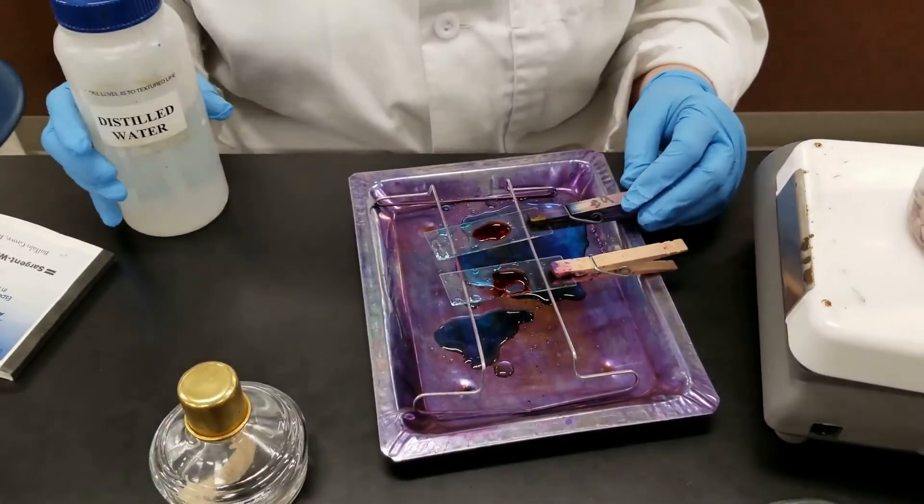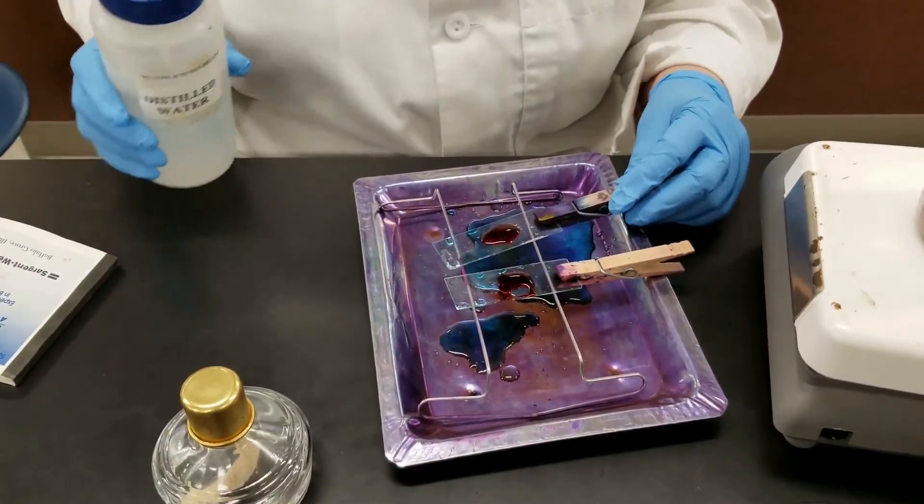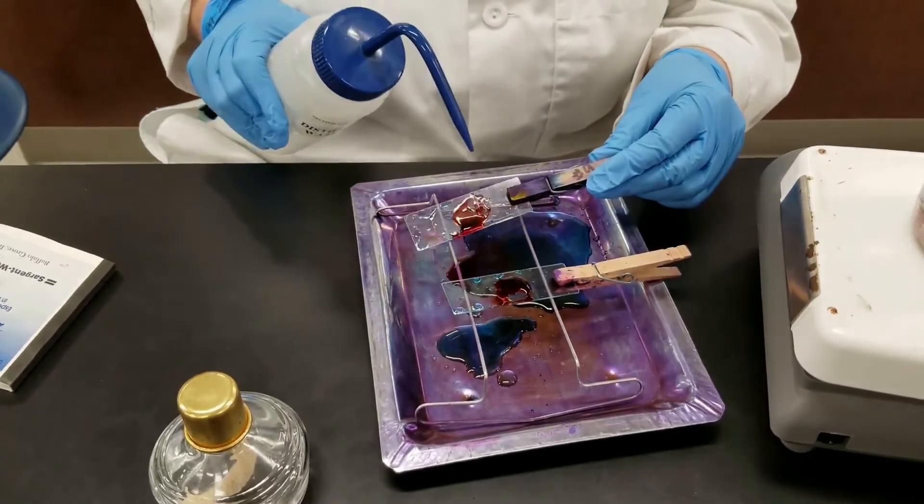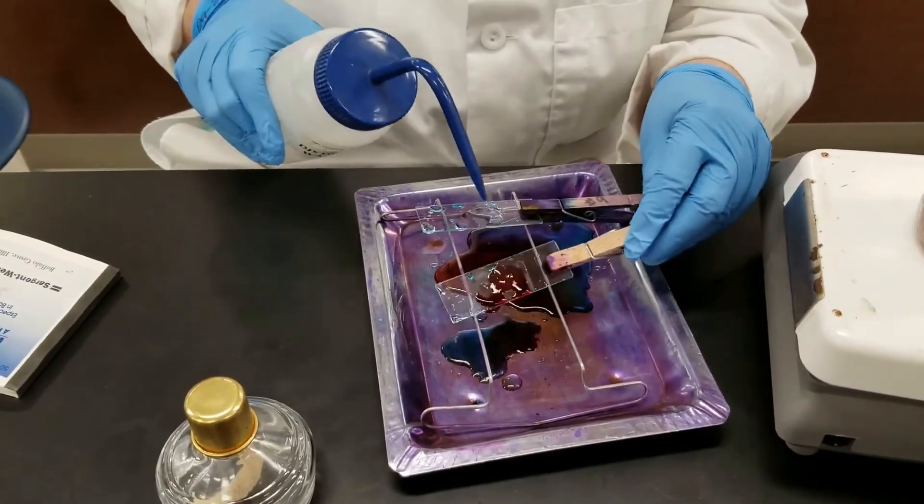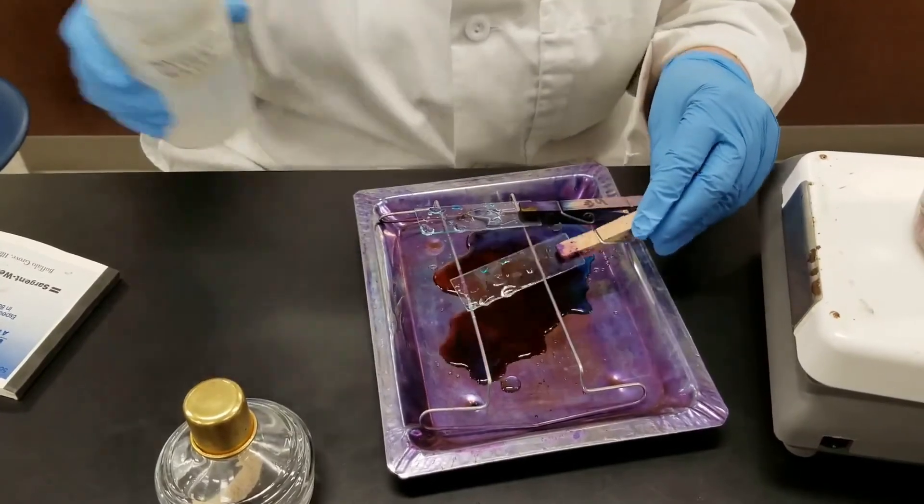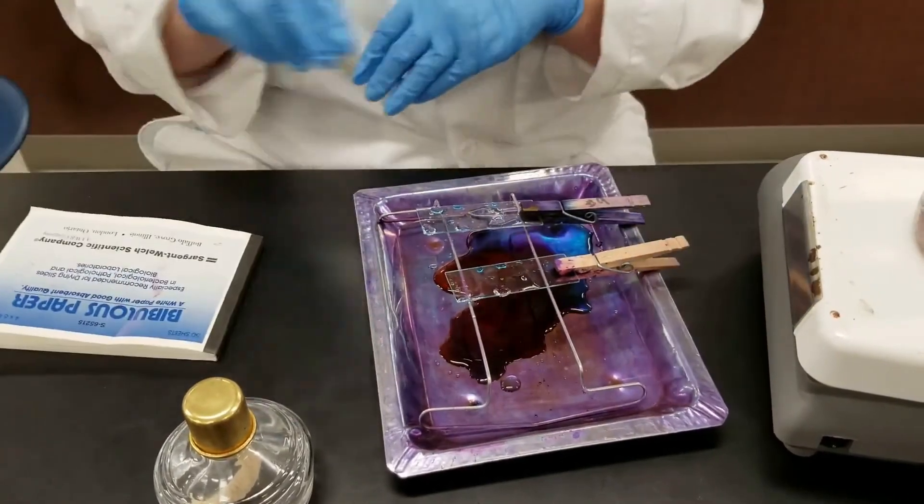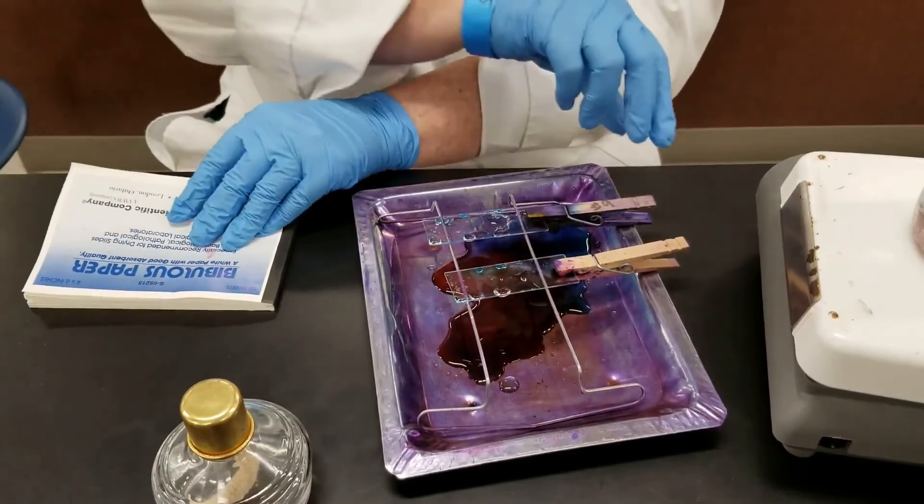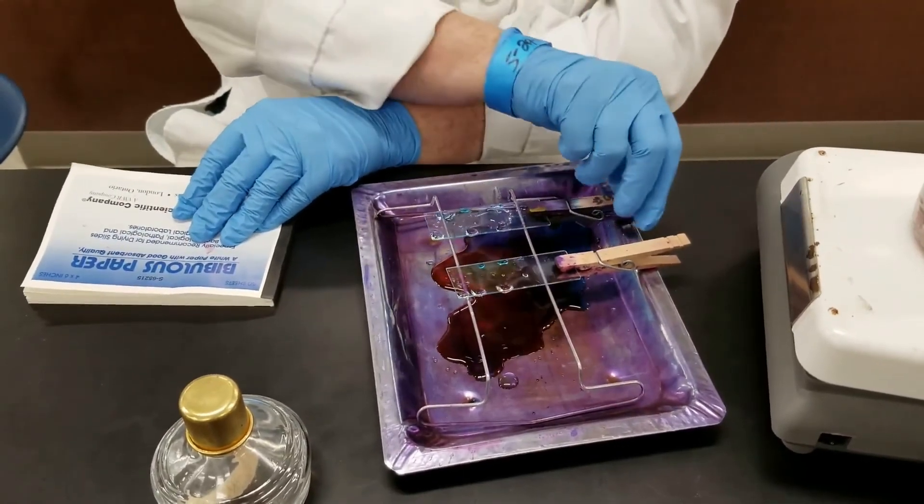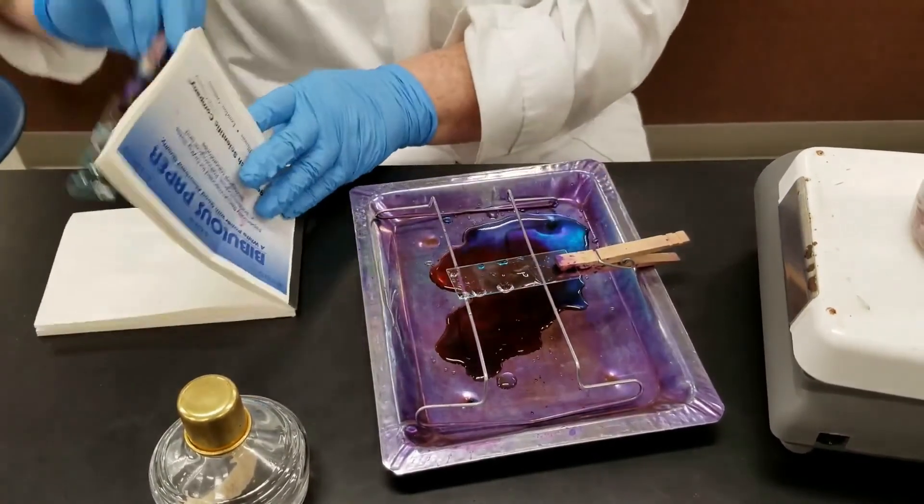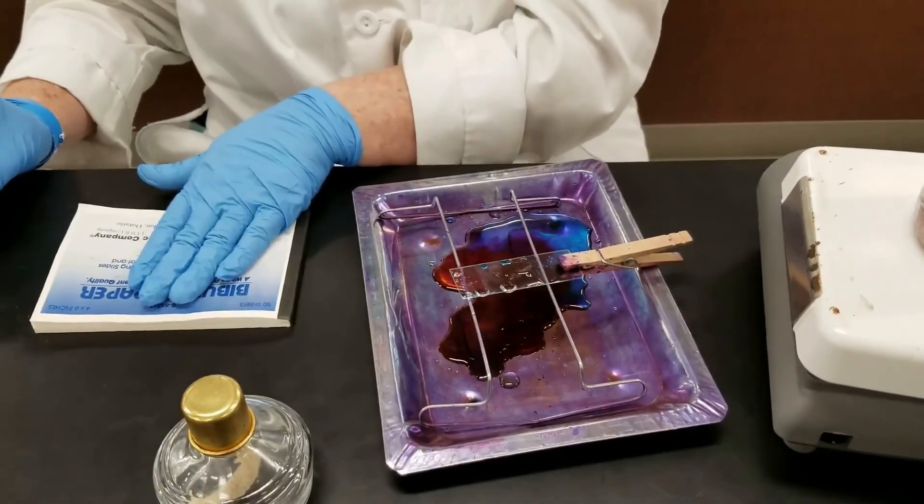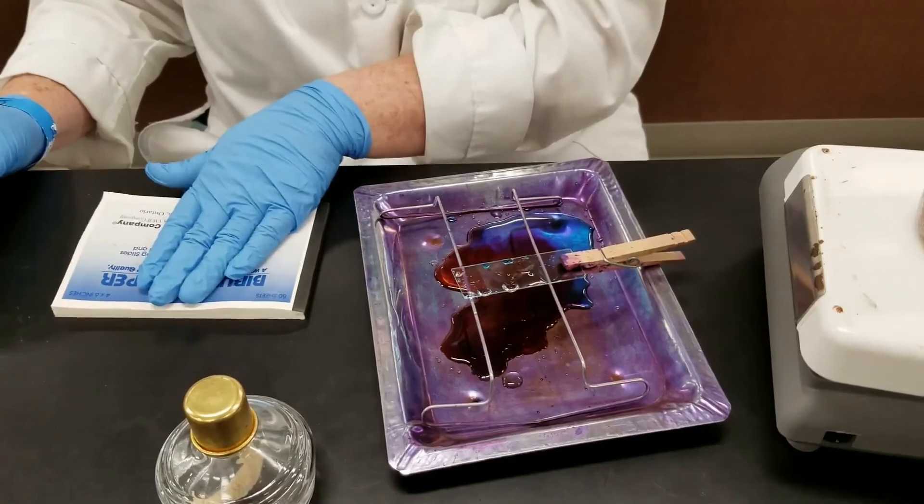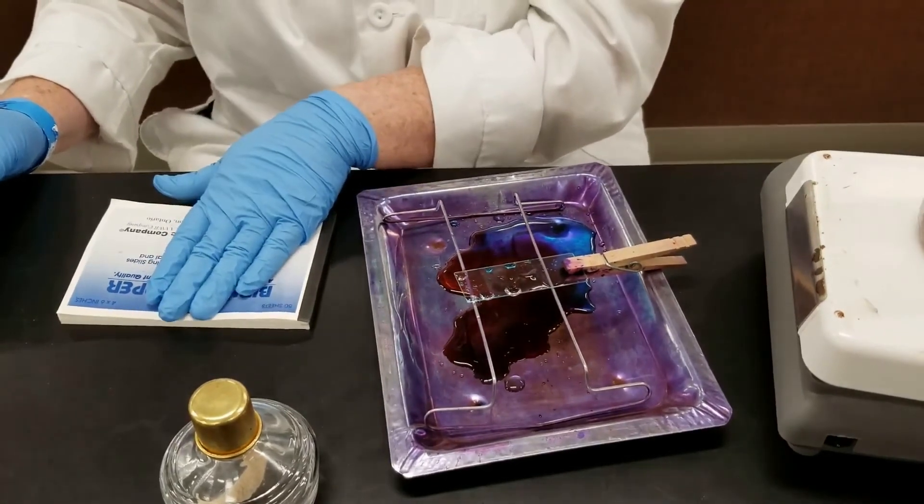Okay, one minute is up. Now we're going to rinse the safranin red off. Just like you're used to for a lot of other stains, we are going to now blot it in the bilbis paper. Remember, don't press it too hard. You don't want to break the slide. When you're done, then we're going to view it under the microscope.